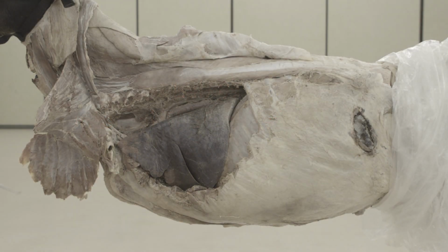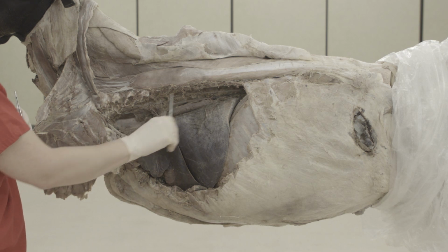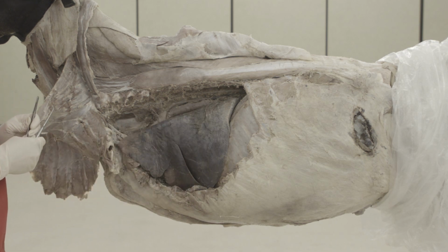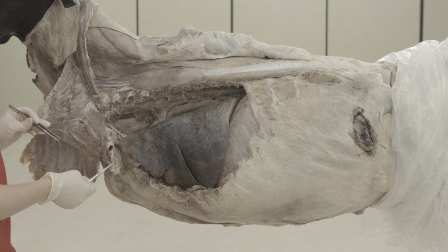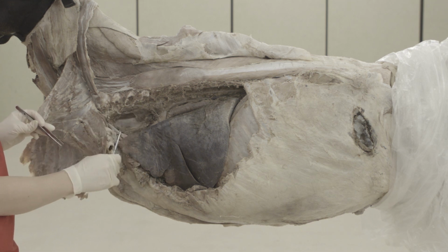So here you can see we've completed the removal of all of the ribs on the left side of the calf here. And then you're also completing that on the right side as well. So for the thorax dissection, we're going to look at the lung, and then we're going to remove the lung on each side and then dissect inside the chest cavity.